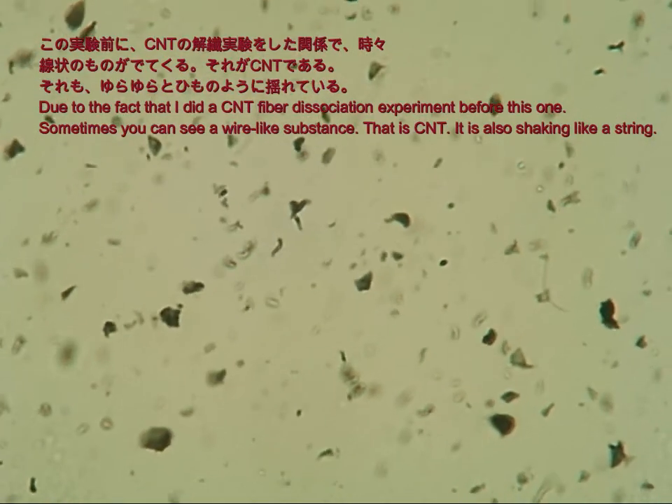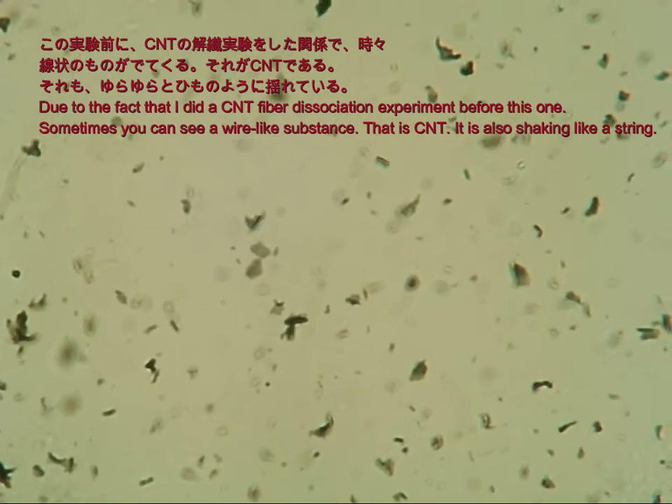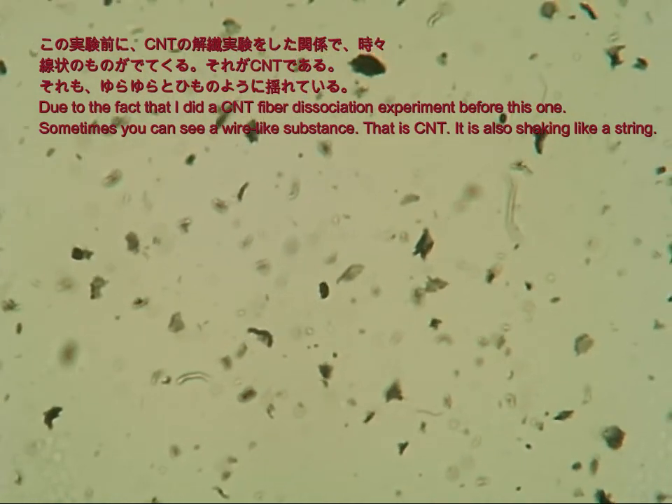Due to the fact that I did a CNT fiber dissociation experiment before this one, sometimes you can see a wire-like substance. That is CNT. It is also shaking like a string.